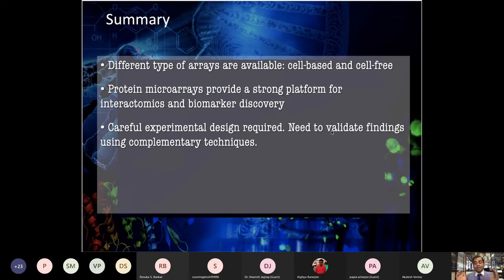After doing these, you can again narrow down your leads, and now you want to make a more miniaturized array, and now you can apply that with a blinded set of samples. So now you do not know what is the control, what is the cancer, what is the grade type. You are taking all those 200, 400 samples in the blinded manner, and now you are going to apply those on the final chip, and you are going to look at the response.